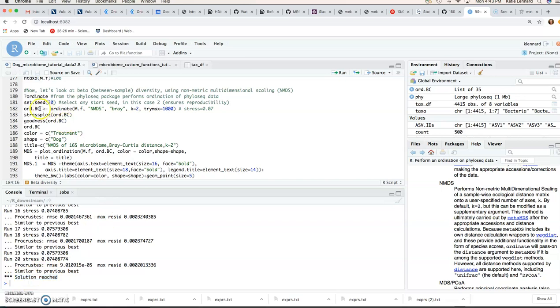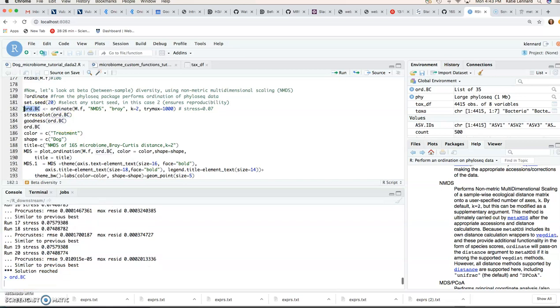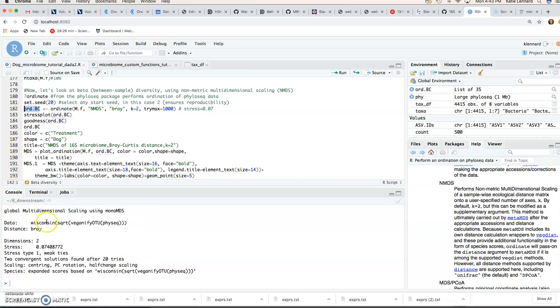So if we have a look at that object, you can see we've got two dimensions. So we specified K is equal 2, distance is Bray-Curtis, and our stress is 0.07. So that's fine. We discussed up to 0.1 as a fair stress to work with.